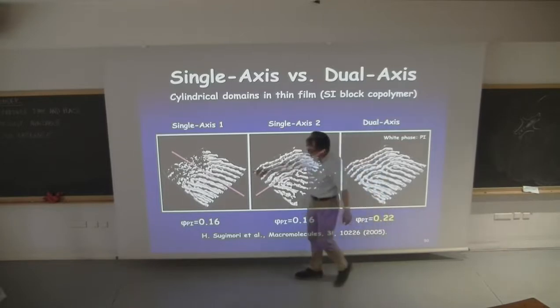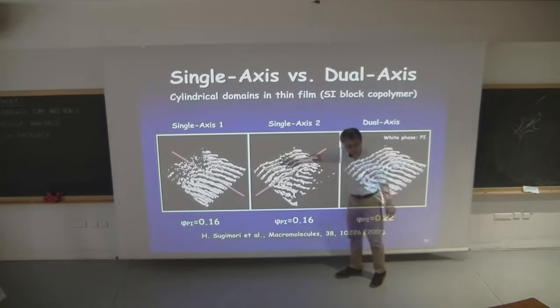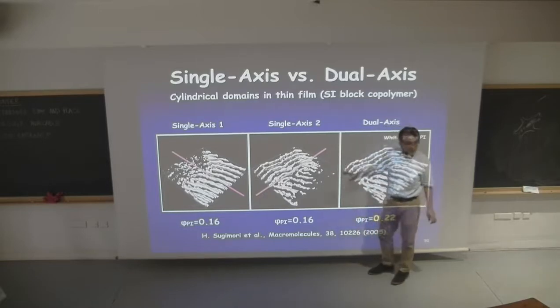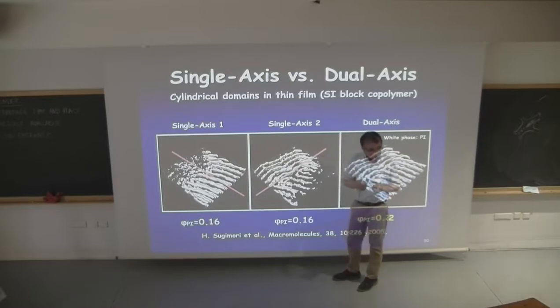Yet here, in this particular tilt, you don't have the structure reconstructed properly. Whereas here, this part is reconstructed properly, but this part isn't reconstructed properly. So particularly if you have a very anisotropic structure like cylinders, then you have to be careful. That's the message. Why? Please go back to the paper, and you can find the reason why. So in this case, for a very anisotropic type of sample, for example FRP, where you have fibers in a resin, that sort of sample.